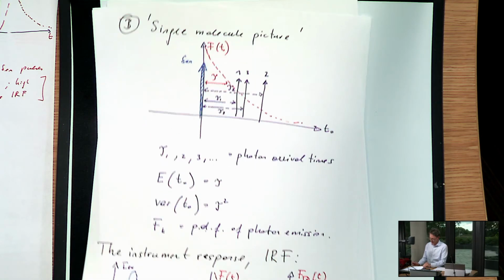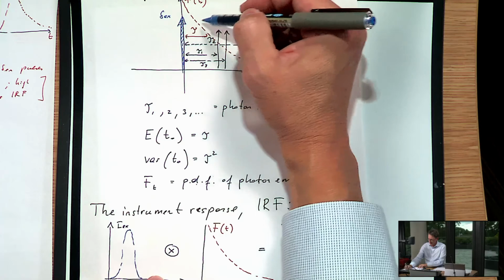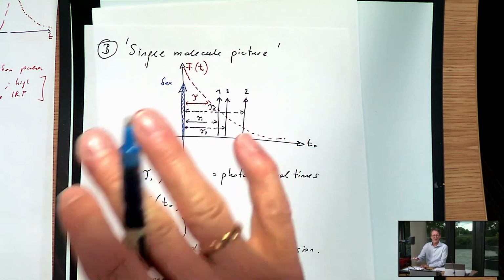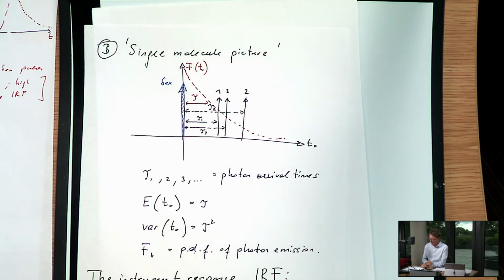So imagine if you had something that has a lifetime that is essentially just a delta function, an extremely, extremely short lifetime. Something that you could use is, for example, an object that scatters light. Scattered light, not fluorescence, will just reflect the excitation pulse back into your system.